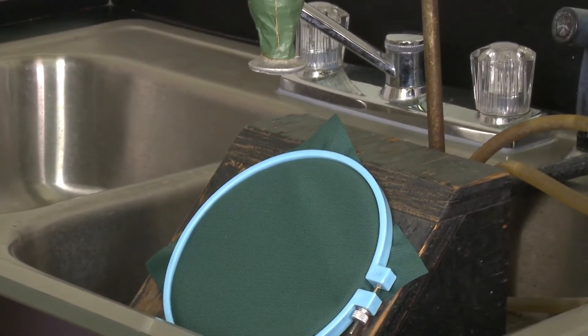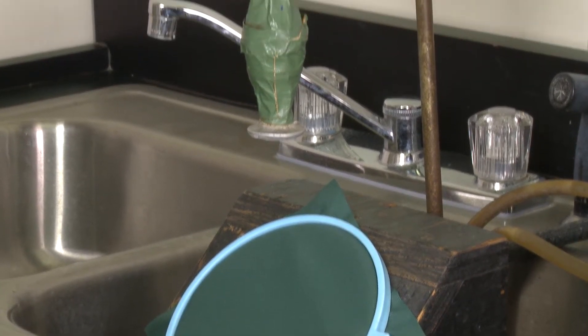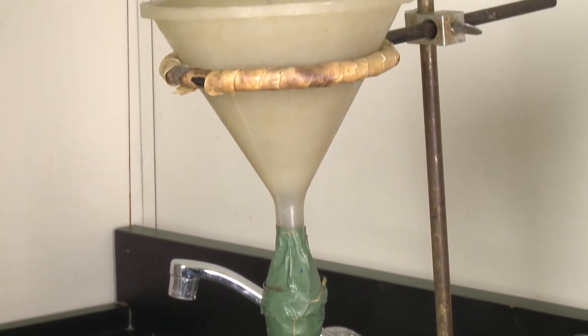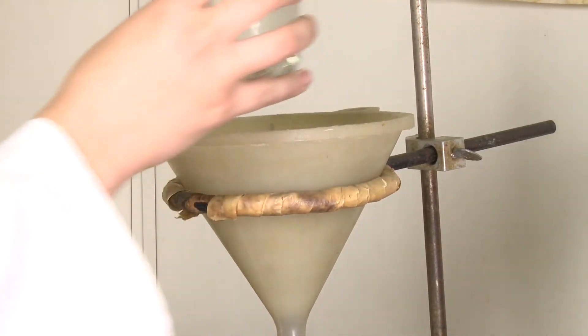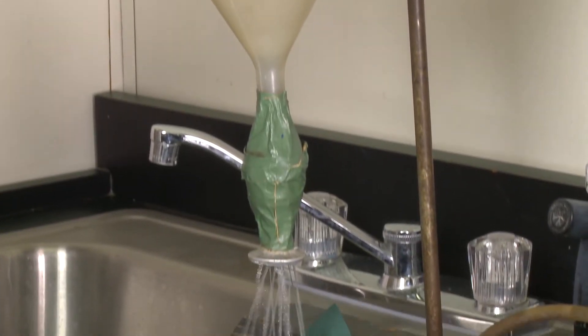In this procedure, the test fabric is placed at a specified distance below the water source. The same test fabric is mounted at a 45 degree angle to the incoming water. A pre-specified amount of water is poured into the funnel and directed to the fabric, hitting it at a 45 degree angle.